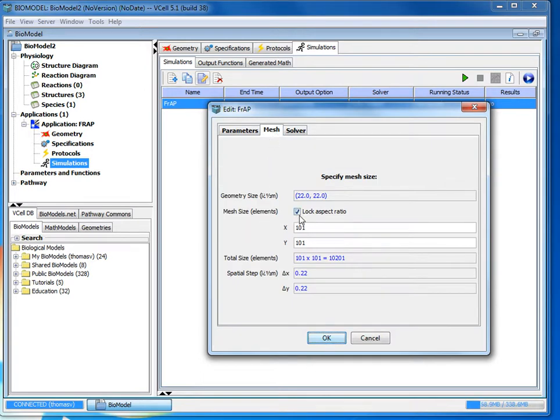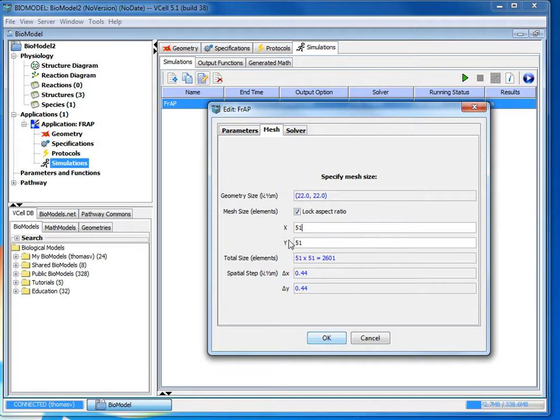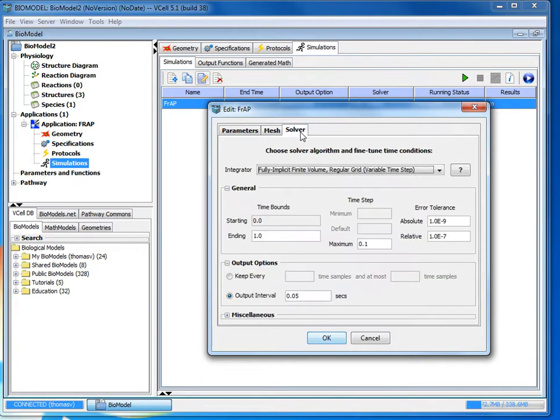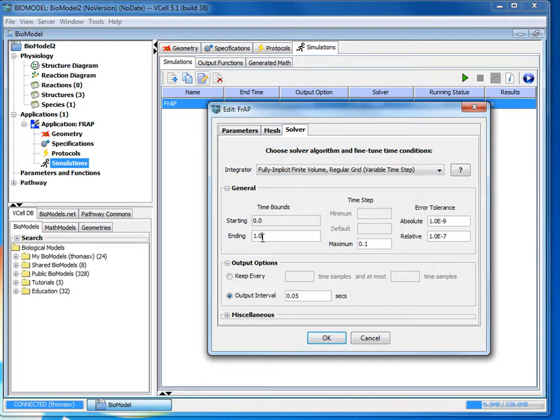For this simulation we do not need to edit the parameters so we'll go to the mesh tab and make sure you have lock aspect ratio checked. What this does is as you change one of the coordinates it'll change the other ones accordingly to maintain proportion. Once you've done that go to the solver tab and you want to leave the integrator as the default fully implicit finite volume. Under general you want to change the ending time bound to 3 and then you want to change the maximum time step from one tenth to one hundredth. Leave the output interval at 0.05 seconds and then you'll click OK to finalize it.